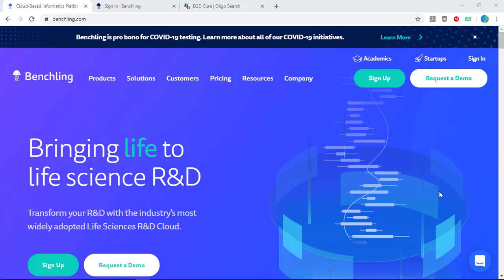This video will show you how to open up your Bagel B DNA sequence in Benchling and use a couple of the tools to design an oligonucleotide we will use to make a mutation in the Bagel B gene sequence.